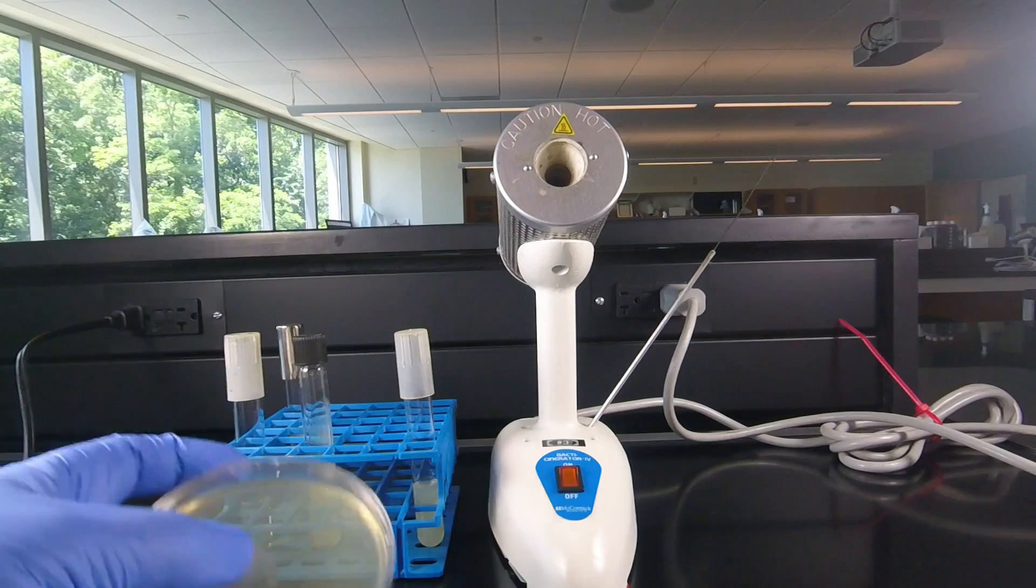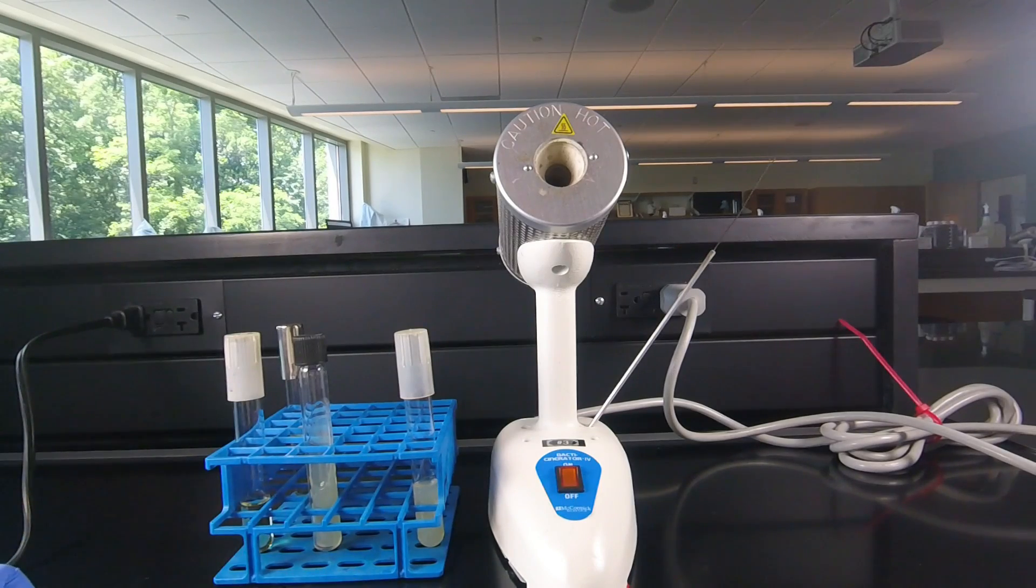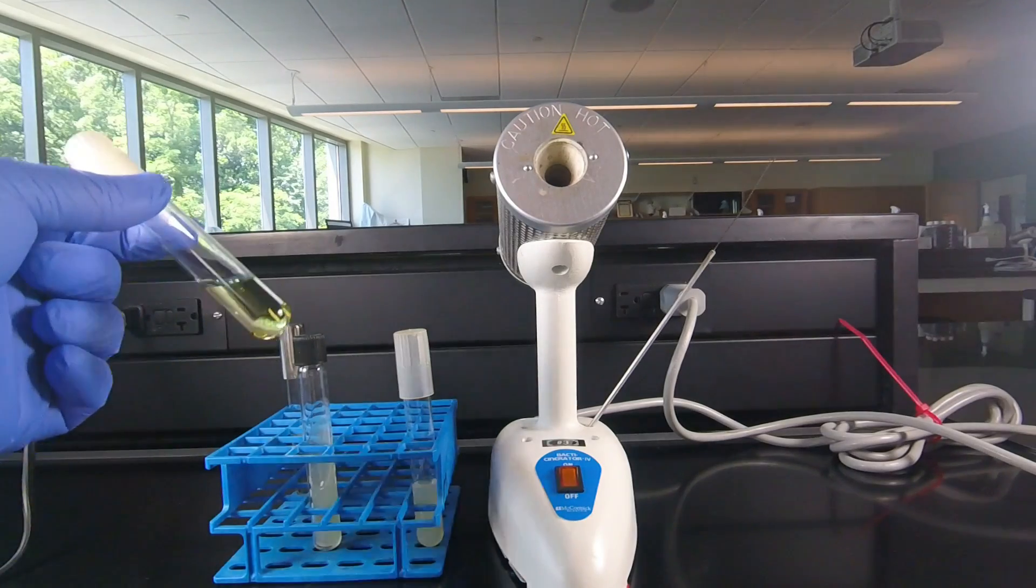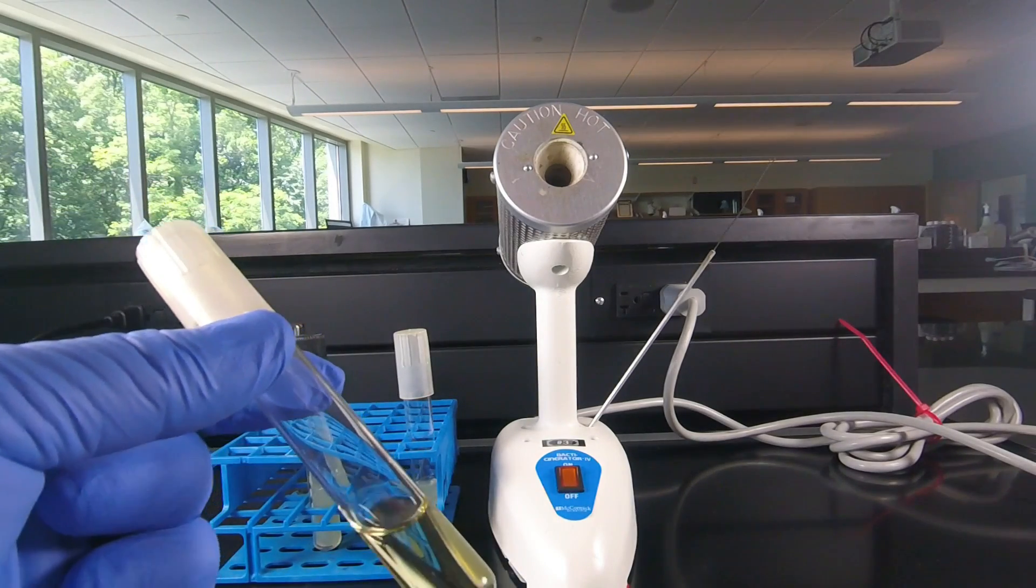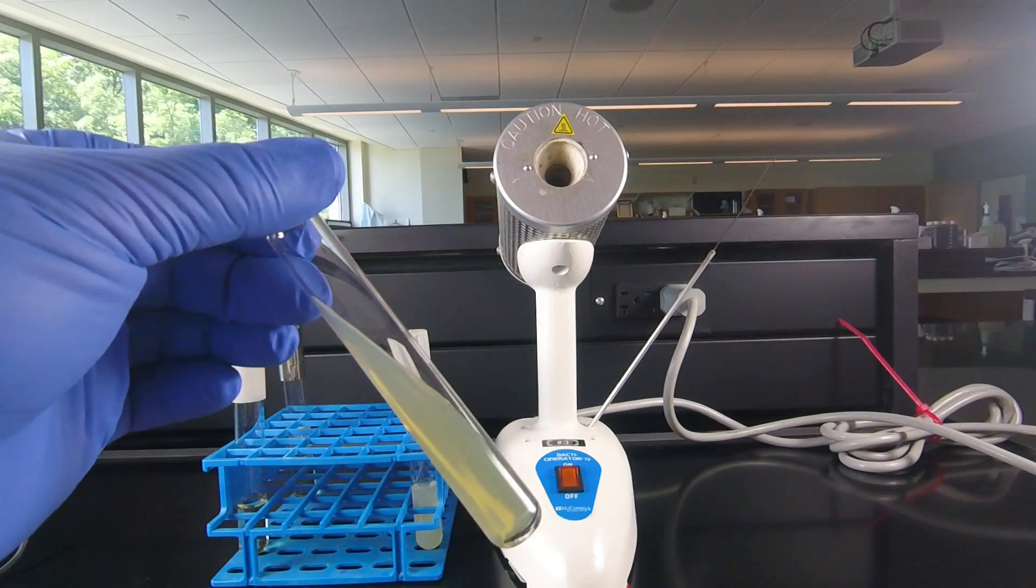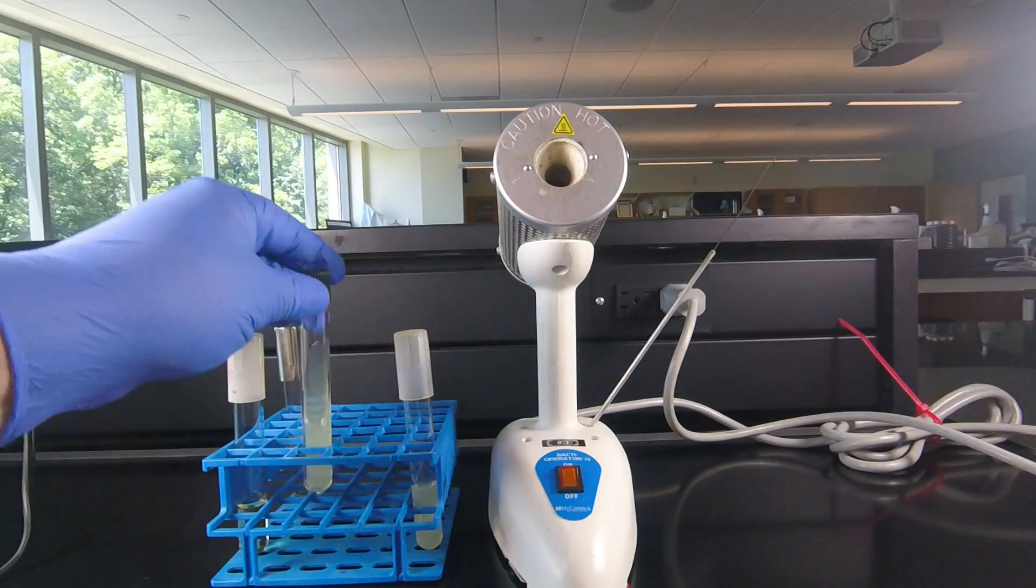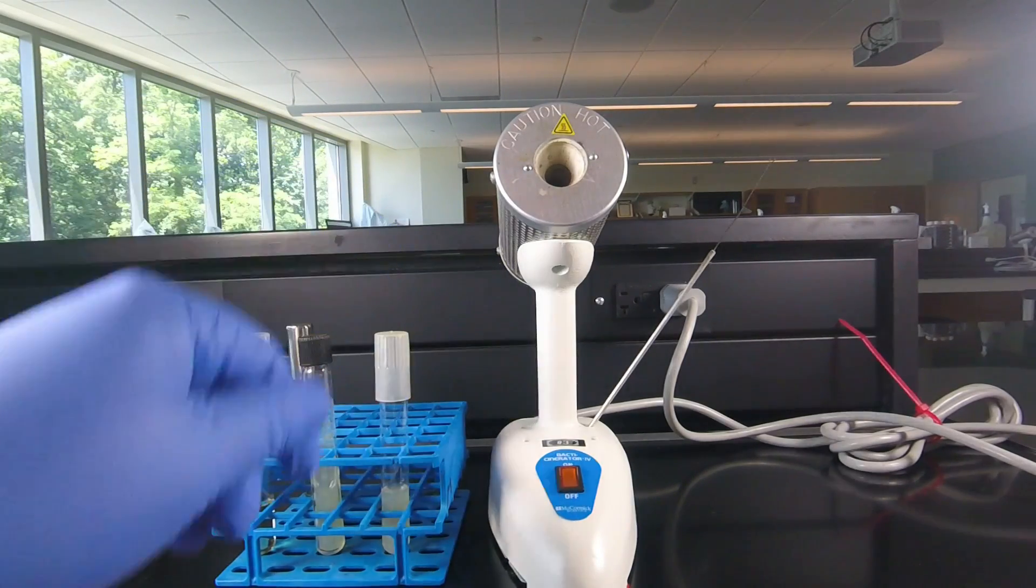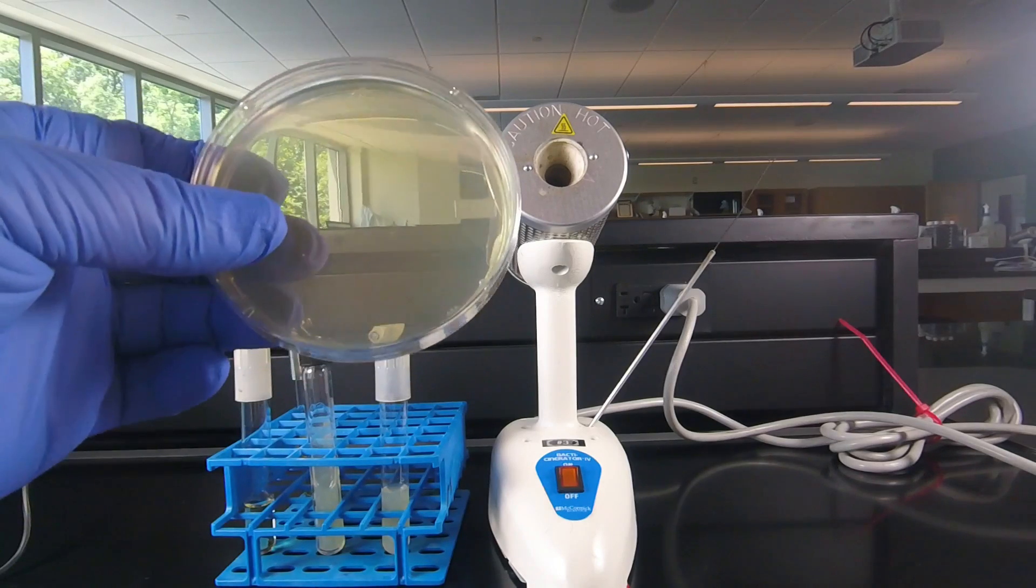So those are the basic forms of growth medium we'll be using or culture medium. The broth tube, which is the liquid. The slant tube, that has a slanted surface. The stab tube, which we inoculate by stabbing. And finally, the petri plate.